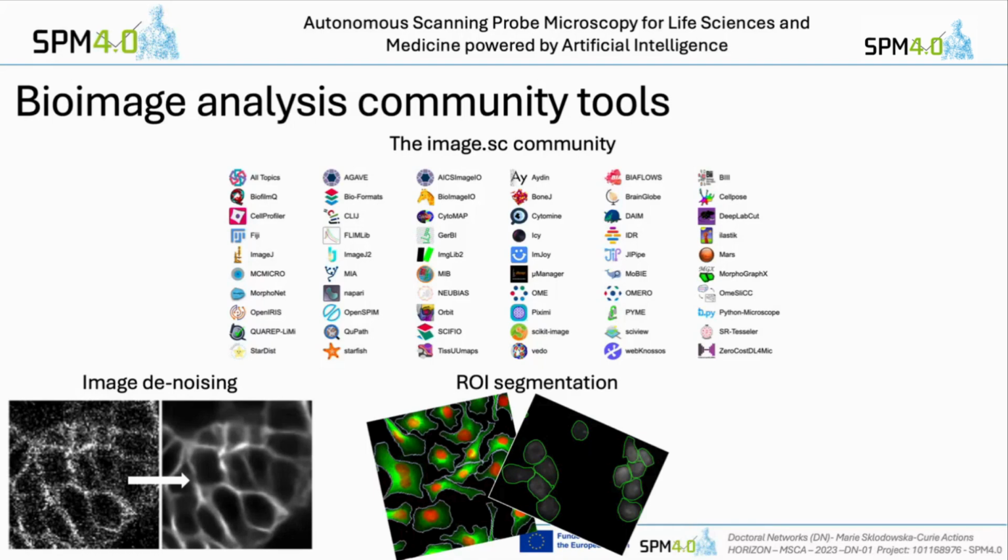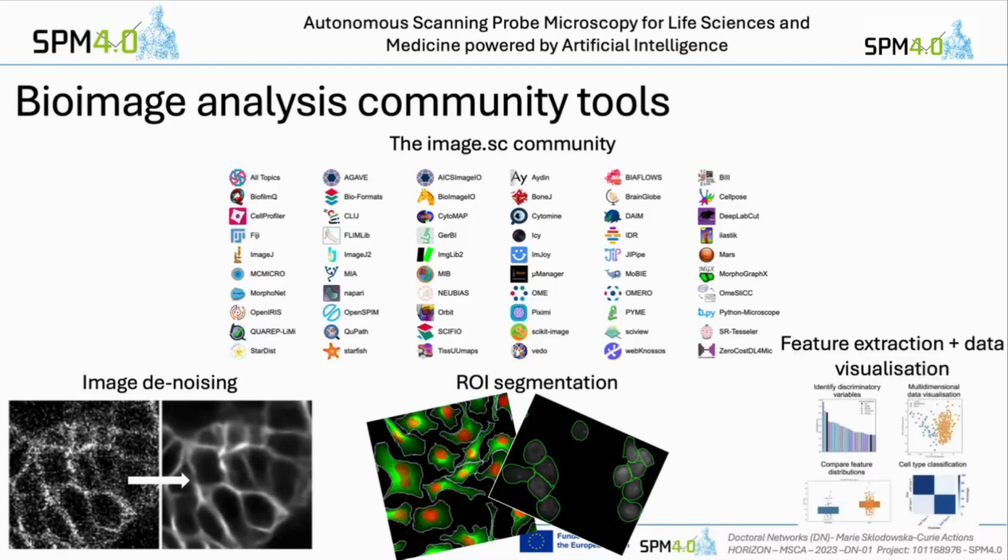If you went to the Bruker workshop yesterday, you'll see something like this that the AFM is doing now. From all of those things, we can extract different features and visualize that data. So there's a load of really good packages out there in the community already for image analysis.